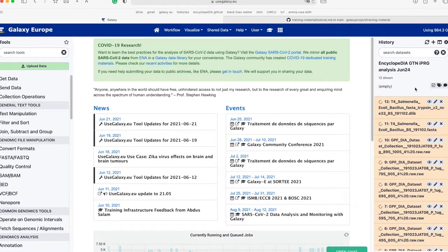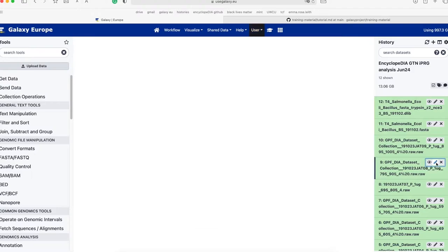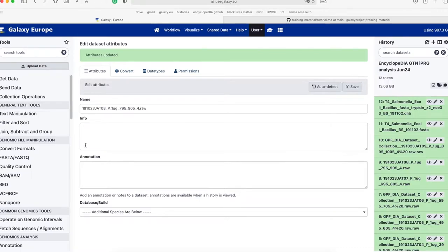Once it turns green and you've uploaded your data, we will be renaming the datasets so that the name only contains the sample name without the %20 character, and we are going to remove one of the .raw prefixes. To do this, click on the pencil icon, Edit Attributes. We will edit the name so it only contains the sample information — in this case, remove the 'GPF DIA dataset collection' as well as '%20.raw'. Now the file name only contains the sample information and one .raw. We will repeat this process for all six GPF files.